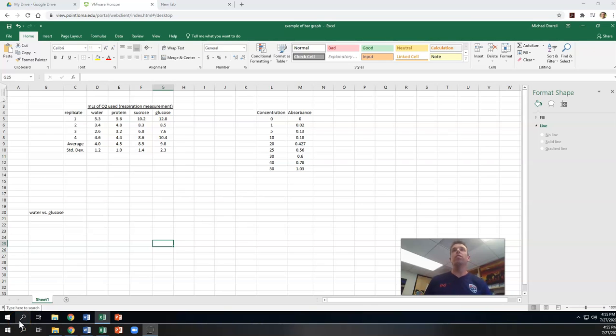Okay, in this video I'm going to go over the Cliff Notes version of how to make a bar graph using standard deviation as your error bars, how to make a standard curve and get the standard curve equation, and then how to do a t-test.